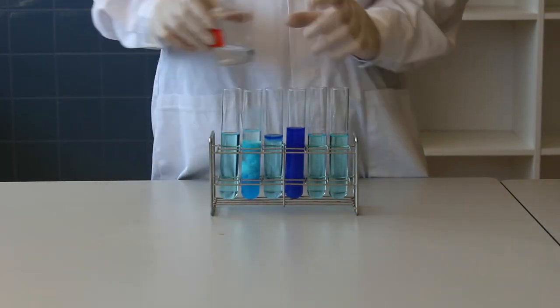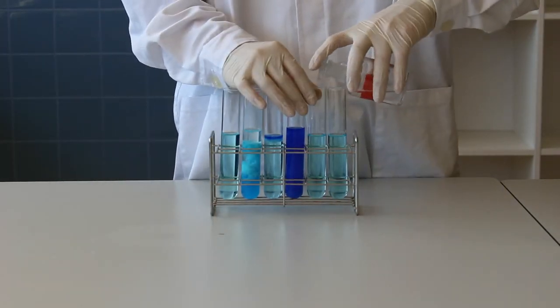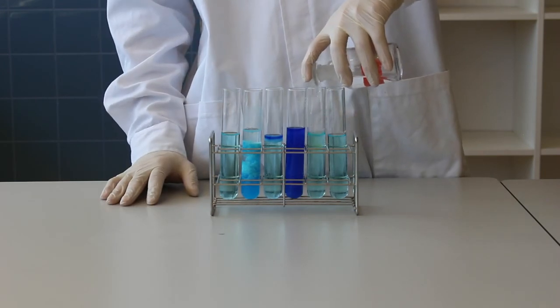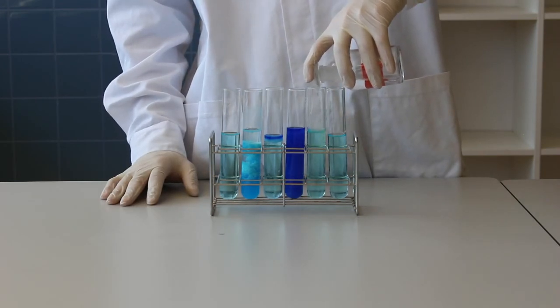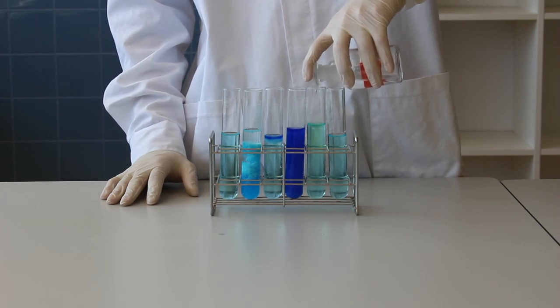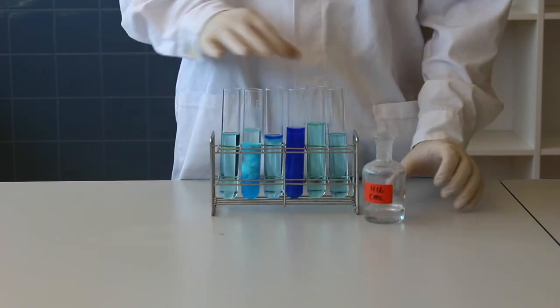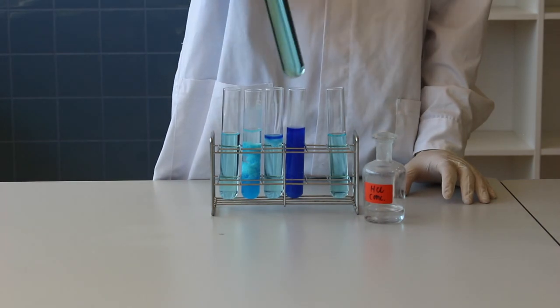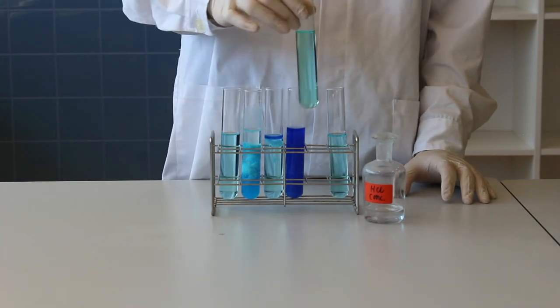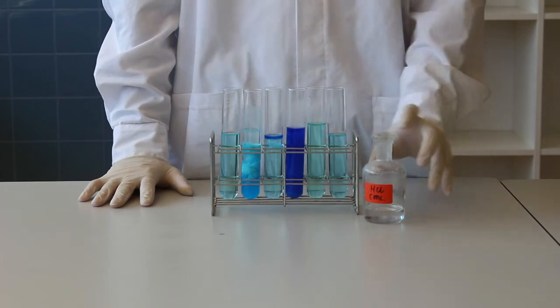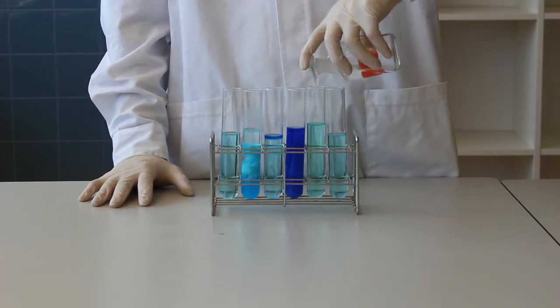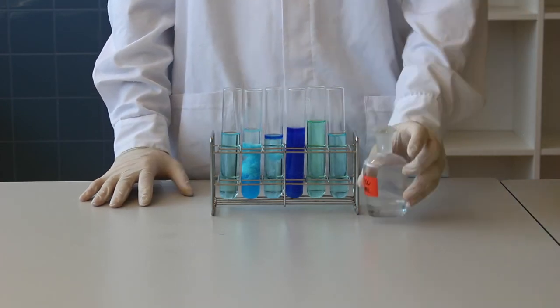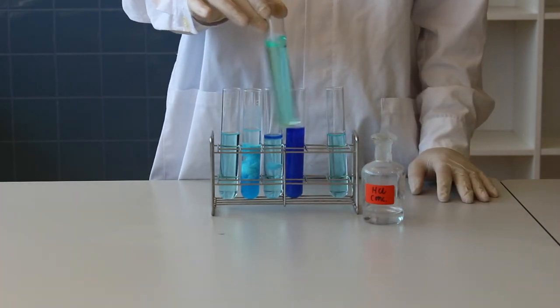Now we add concentrated hydrochloric acid to a solution containing hexa-aqua copper ions. The six water molecules will be replaced by four chloride ions. This reaction is reversible, and due to this, you get a mixture of colors due to both of the complex ions. The hydrochloric acid will create tetrachlorocuprate ions, which have been described as olive green or yellow.